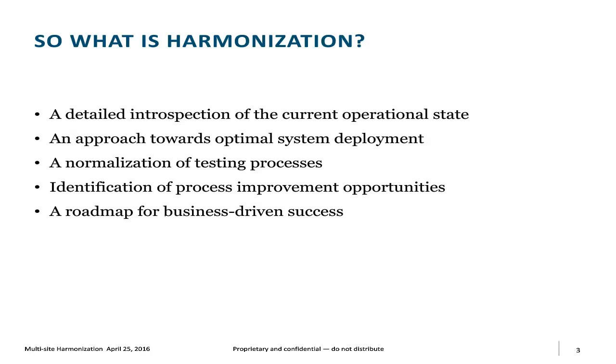And again, we'll go through the process in detail. But you can believe that if people have been using a system for years or using a process, even a paper process, they will absolutely have opinions on how to improve that process. And nothing is better than having a forum for those people who have been basically suffering at the lines of infantry, the folks that work up from the lab level, that work at the sample handling level, that work at the reporting, the review level. They will certainly be able to tell you what kind of things burn up their time in a day. And so we have that opportunity in a future state environment to get rid of some of those things that burn up time and help make people more productive.